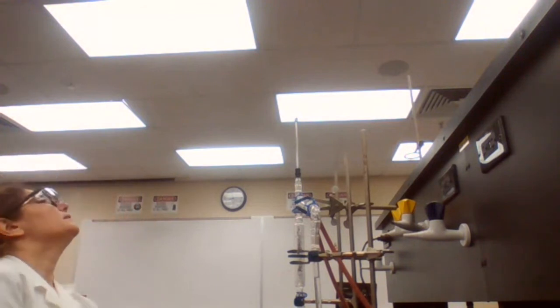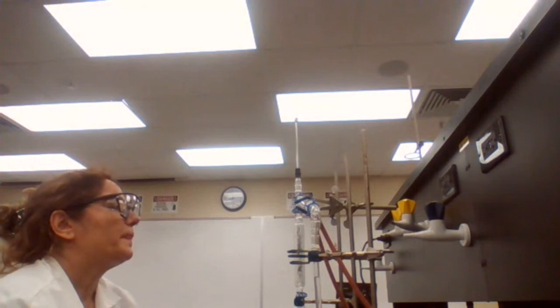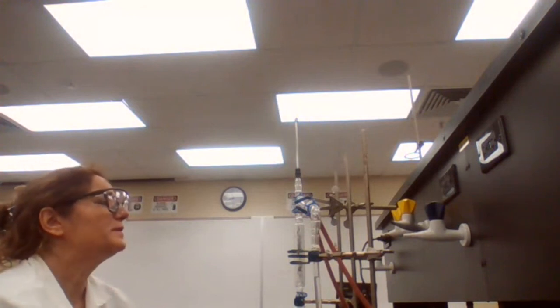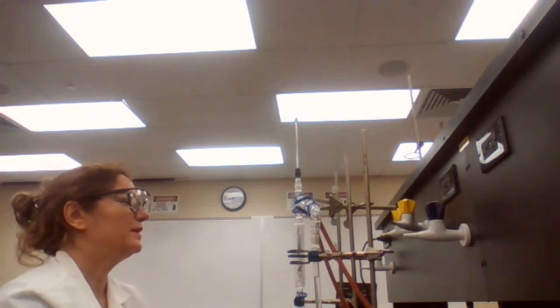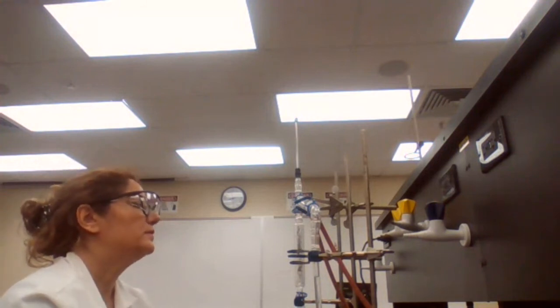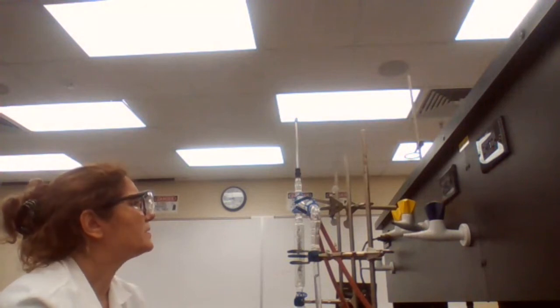9, it actually dropped down to 70, and the vapor slowed down actually. So from now on, it looks like we are either waiting for compound B or the last drops of compound A. This is very slow now.